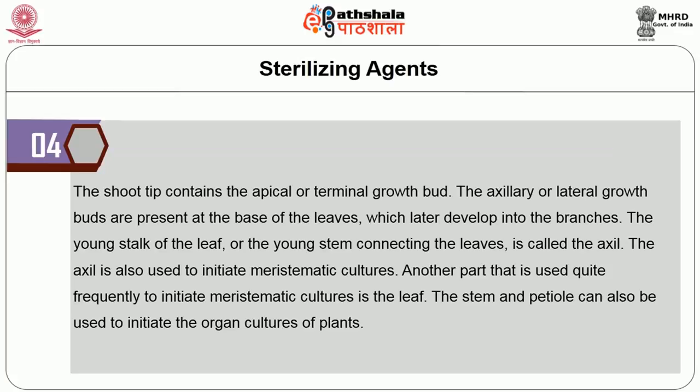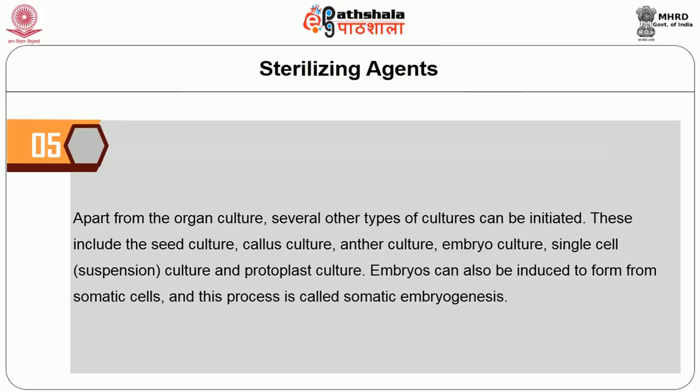Apart from organ cultures, several other types of cultures can be initiated. These include the seed culture, callus culture, anther culture, embryo culture, single cell or suspension culture, and the protoplast culture. Embryos can also be induced to form from somatic cells, and this process is called somatic embryogenesis. Having considered the major requirements, let us now move on to the medium preparation.